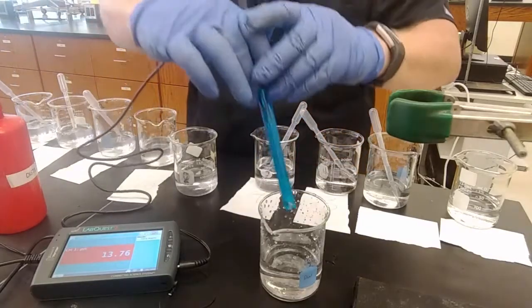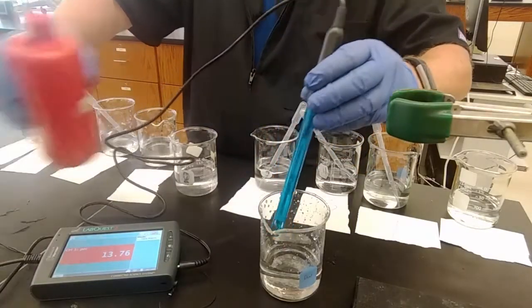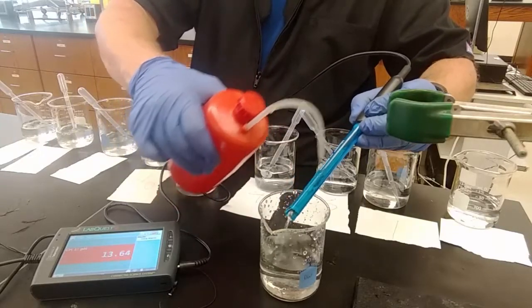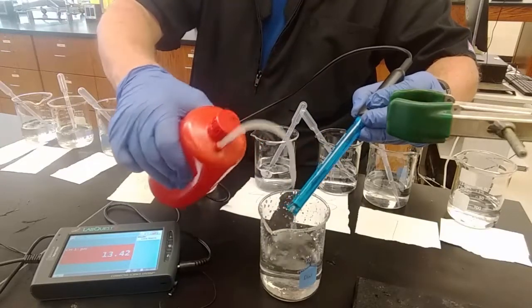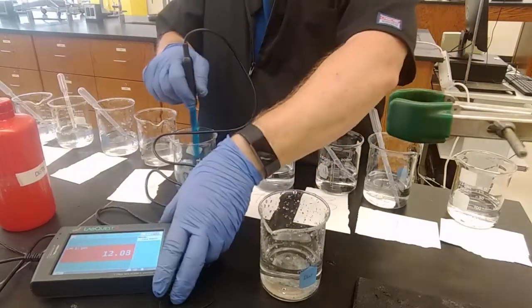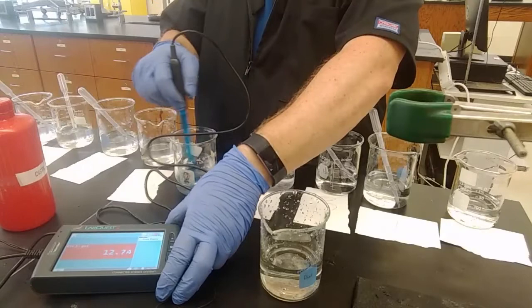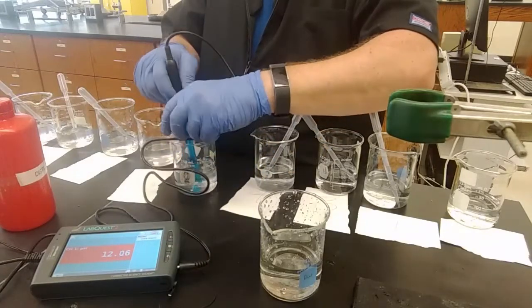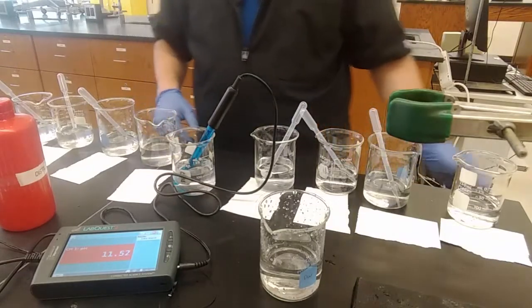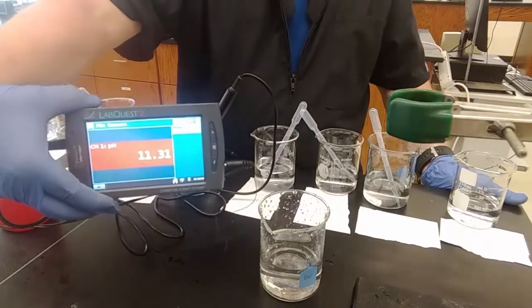Right? Just for fun, one last test before I put away the meter. Let's go back to our deionized water and see how we fare now, having gone to that other end of the spectrum. We're going to have to let this settle for a little while.